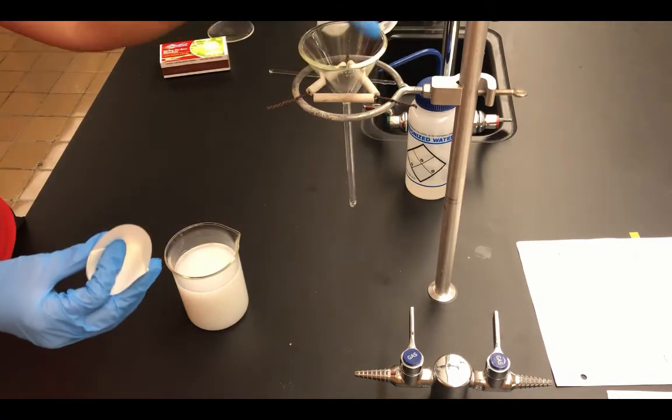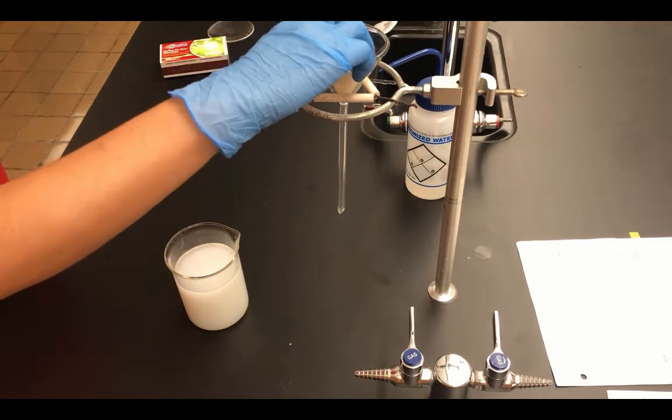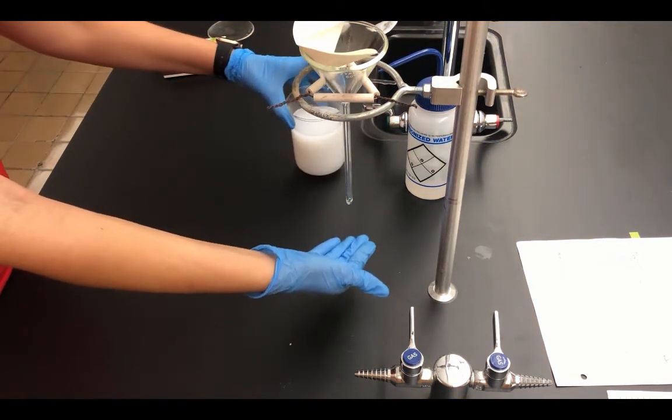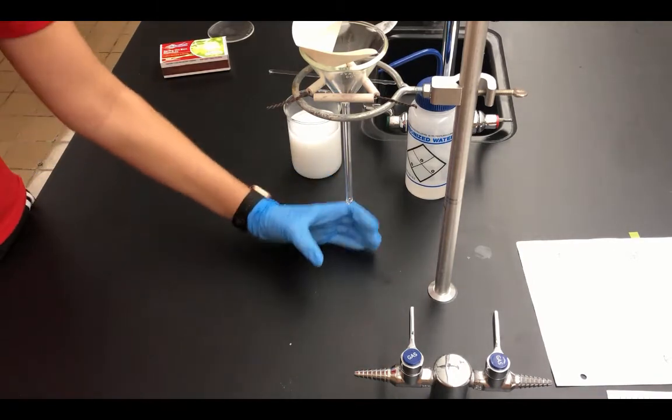Now that I have my filter set up, I have my funnel, and my filter paper will go right into the funnel. Now notice I don't have anything underneath it. I'm still letting my precipitate settle, but notice I don't have anything underneath this funnel.